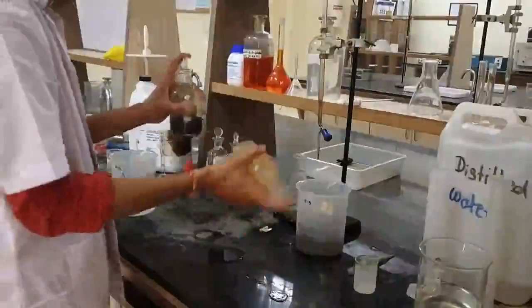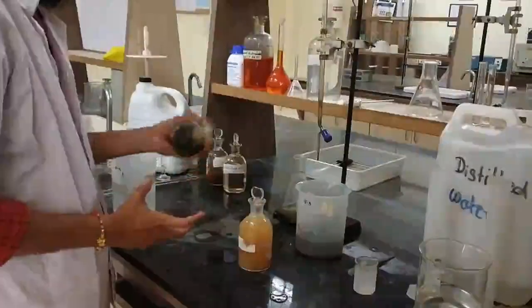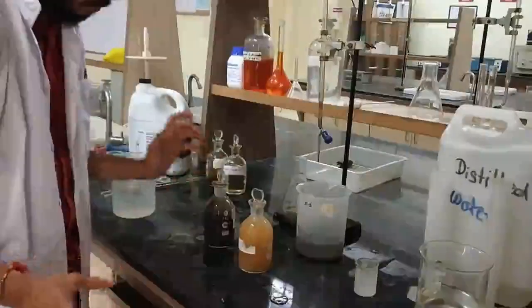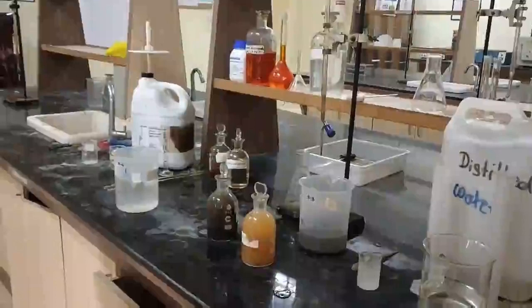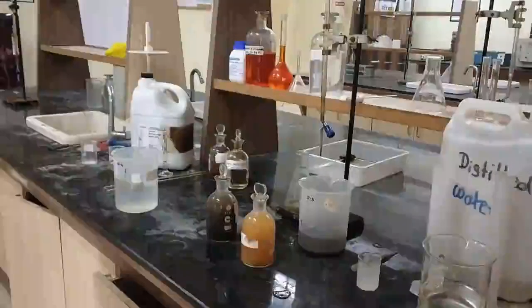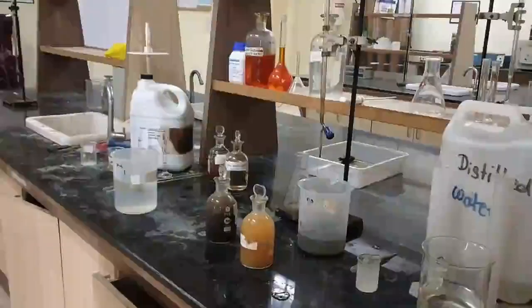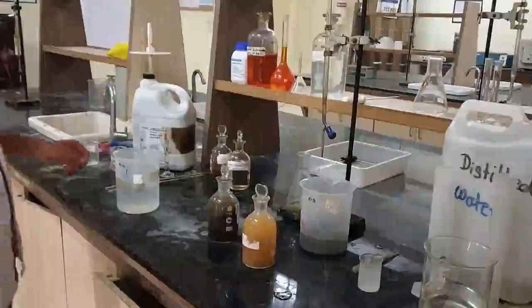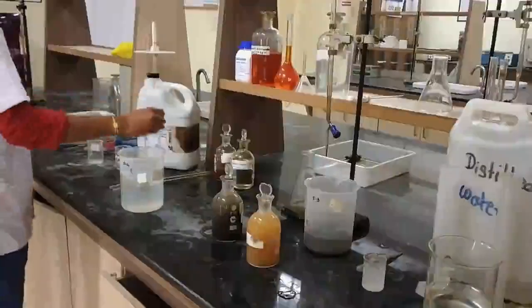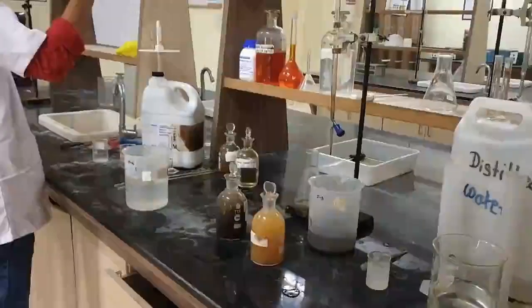You can turn the bottles upside down here, and you can see the brown PPT, and here you will be seeing there's a blackish content, but initially you can see there is a whitish PPT that is formed, which is not yellow in color. There is a white PPT that is formed initially you have seen, but now because there is a high organic content and there is a blackish color to this sample, here we got the black color, but you will be seeing in the bottle.